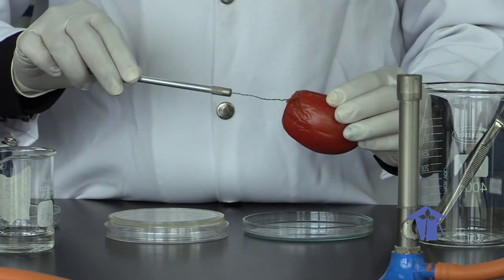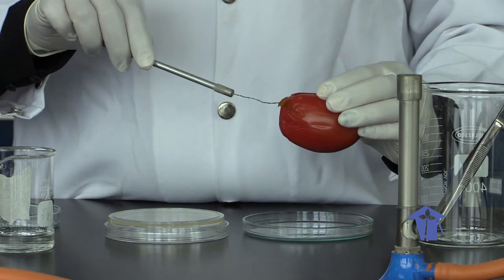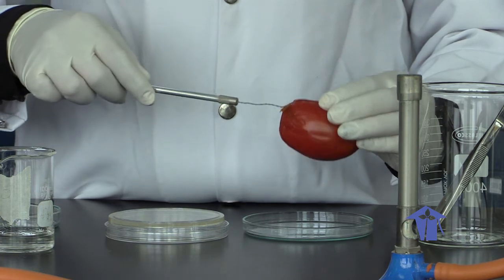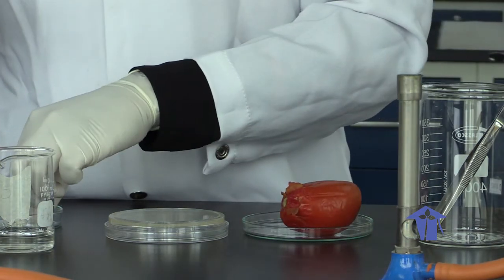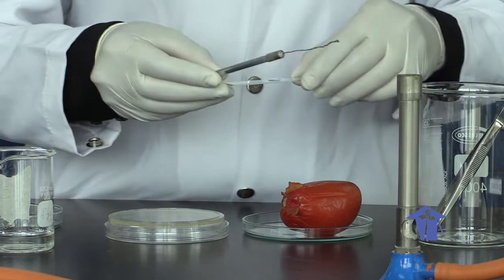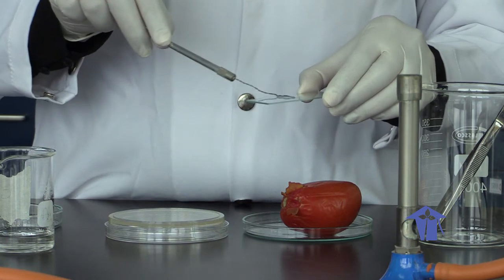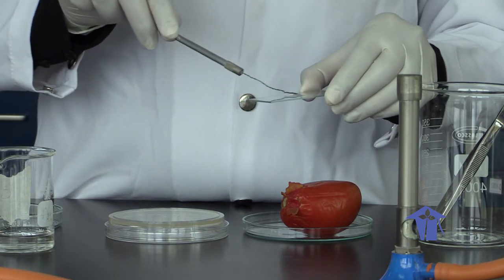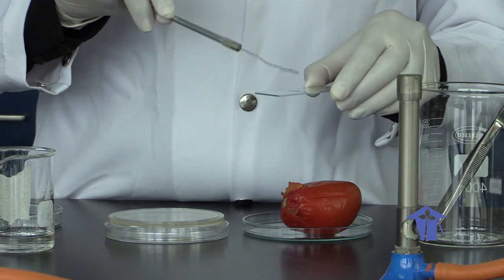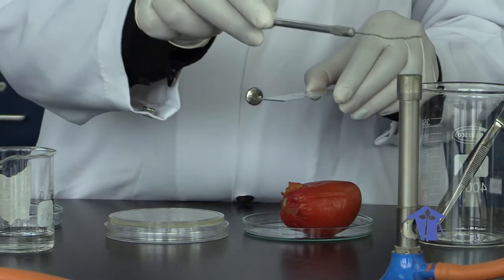Our second step is for us to take a sample for our Gram stain. So again, in the same area where we took our sample for our quadrant streak, we are collecting a sample of our diseased organism. And on a glass slide with a tiny droplet of water, we deposit our sample. Sterilize.